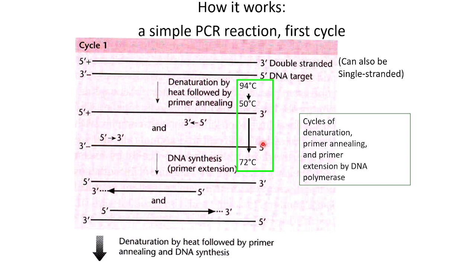First denature, then add the primers and anneal them, followed by the extension using the DNA polymerase.